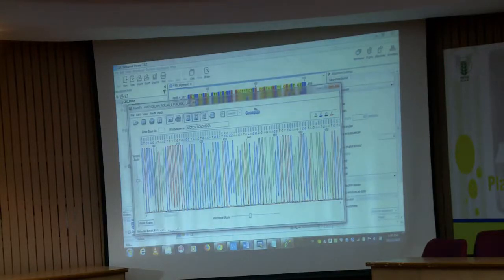So, in that particular alignment, if this T is there, then I will go that okay, this T is actually T, I do not have to change it. But let us suppose this T is not T over here, I will check in both the sequences, the forward also and the reverse also.